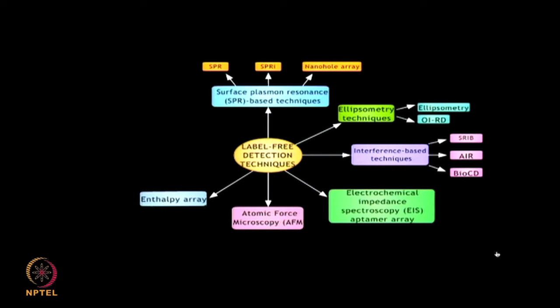Enthalpy array, thermodynamics and kinetics of molecular interactions measured in small sample volumes without any need for immobilization or labeling of reactants.